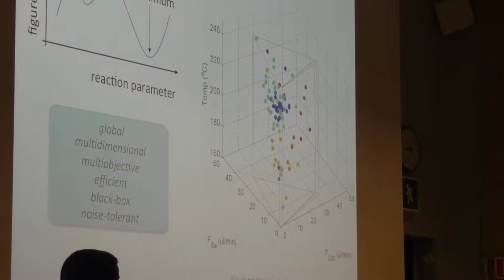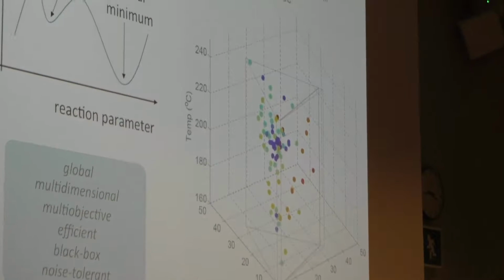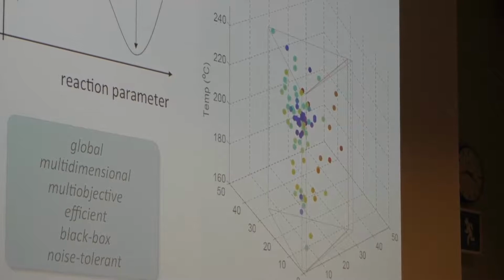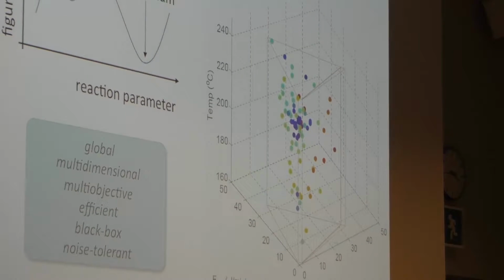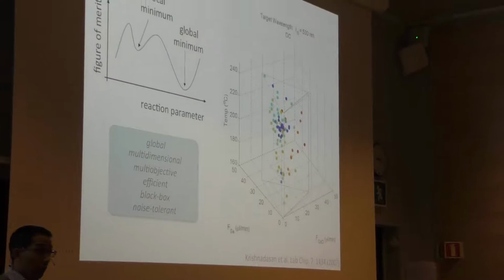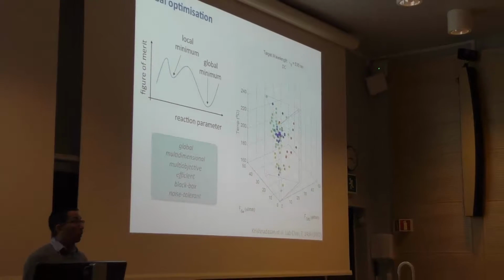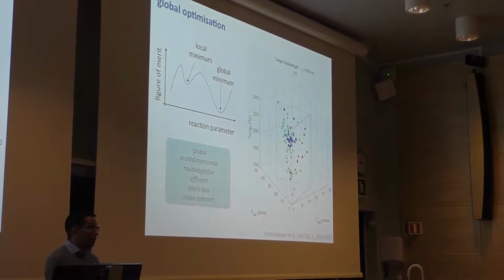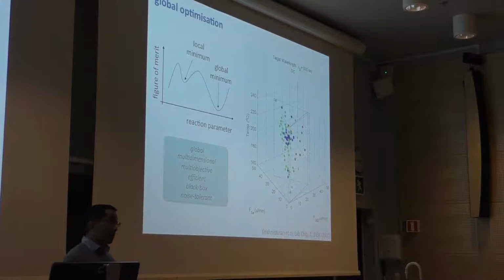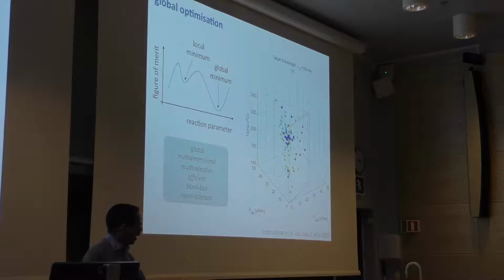Each of the dots corresponds to a different set of reaction conditions, and the colour of those dots tells me how happy I am with the outcome. And the way we set up our problems, the lower the value we measure, the happier we are. So in exactly the way that Bjorn was explaining this morning, we create a fitness function that specifies how close our current product is to what we want. And we define our fitness function so that lower fitness values correspond to a better product.